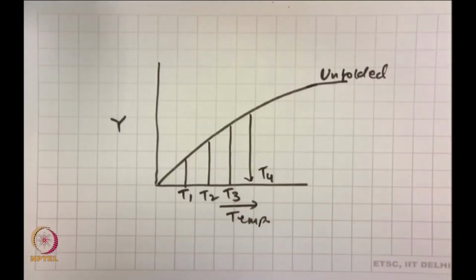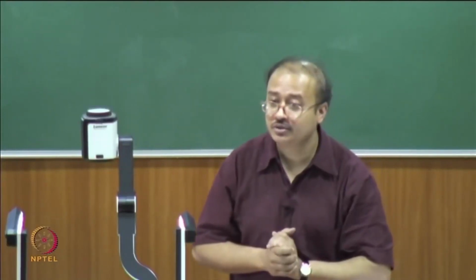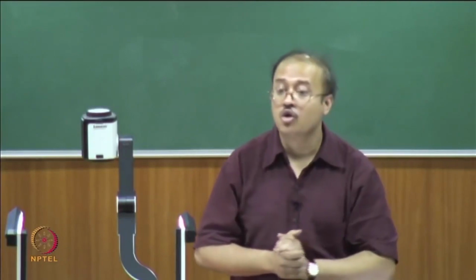Is it clear? So, again you take any protein, but before you do a temperature jump, what would you rather do? Tell me, before you would do a kinetic measurement, assuming the fact that you have a temperature jump instrument with you, right. I have not talked about the instrumentation, I will just go over it briefly in a couple of slides. But again the question is, if you have a temperature jump instrument with you, you are given a protein which you do not know much about, would you go for a temperature jump straight away? Would you start with a temperature jump? Yes or no? No. What would you rather do first?